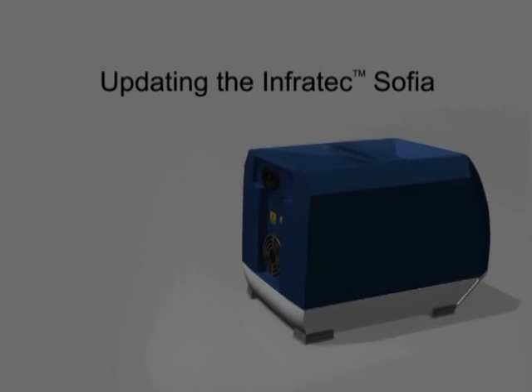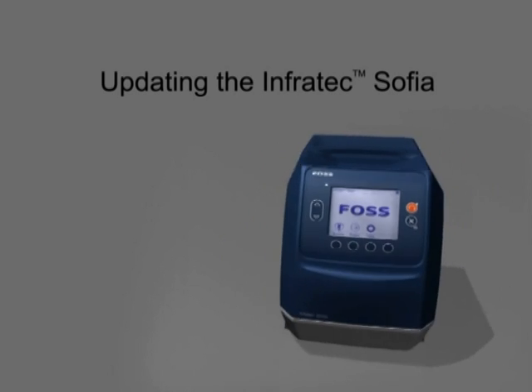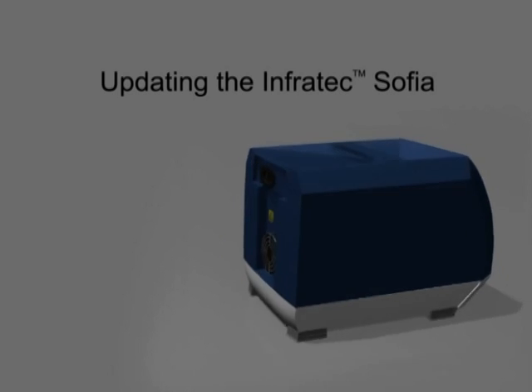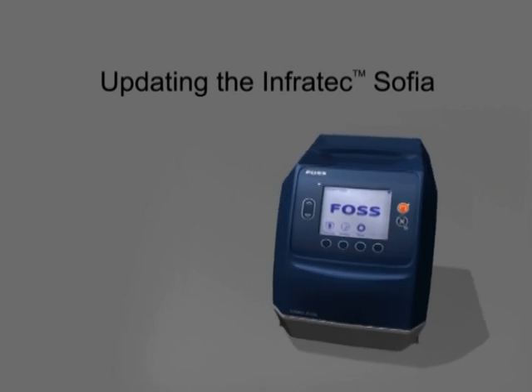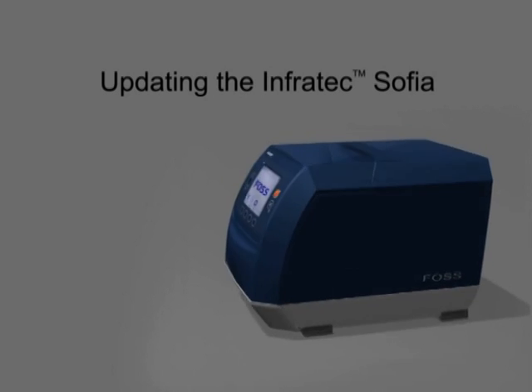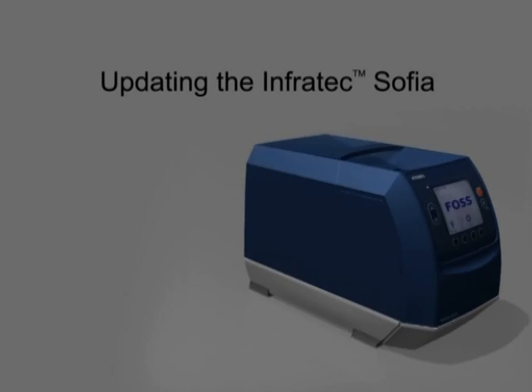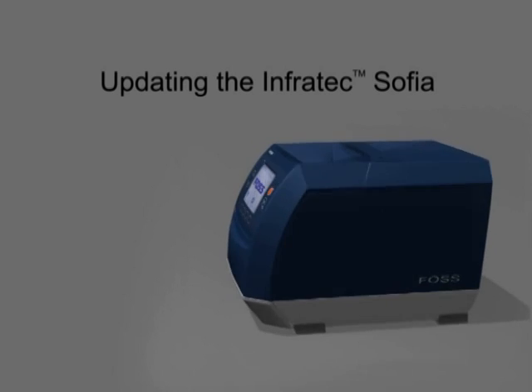The SD card is not only used for storing test results, it is also the means by which upgrades to instrument software, updates to instrument settings and calibrations, and new calibrations allowing for analysis of additional crop types are downloaded to the instrument. At the same time, test results and data from the instrument can be uploaded to a server for viewing and management. All this is achieved using the computer-based Mosaic software and the Internet.